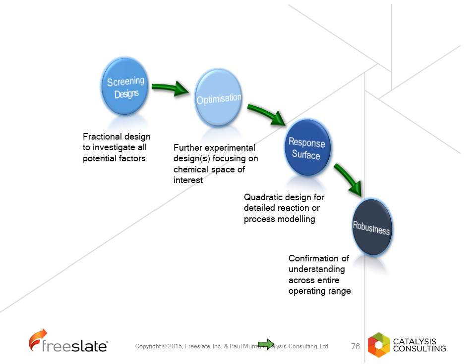We have response surface designs, which are quadratic designs, to give detailed knowledge about a process. Response surface designs are something which, in my experience, only get used in a process where you're looking to make a commercial process and right when everything else is fixed. And I would do probably 90% of my work in screening and optimization, 7 or 8% of the work in response surface, and a little bit in robustness design.